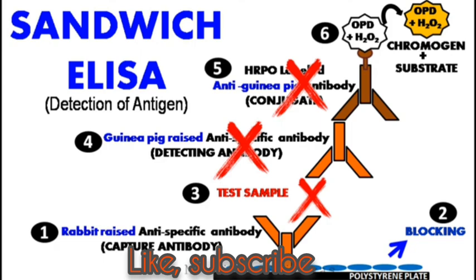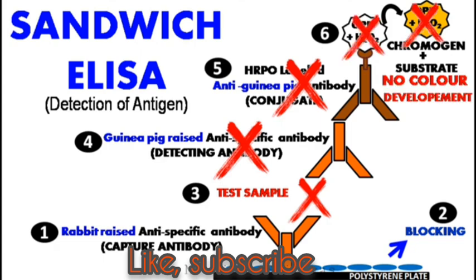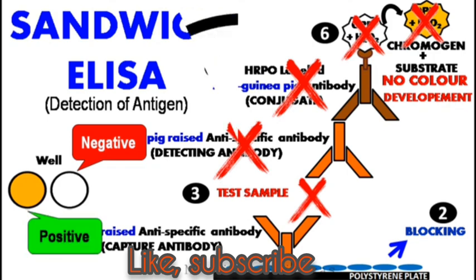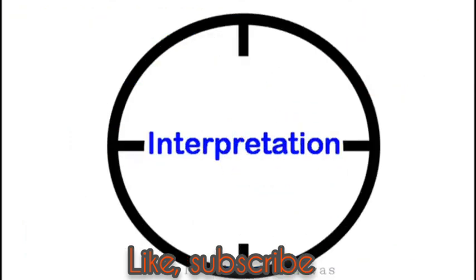So in absence of HRPO conjugate, no catalytic reaction, and therefore no color development occurs, which indicates the test sample is negative for a particular antigen. So, here also, lack of color development indicates the test sample is negative, and the color development indicates the test sample is positive. How the color development is interpreted.